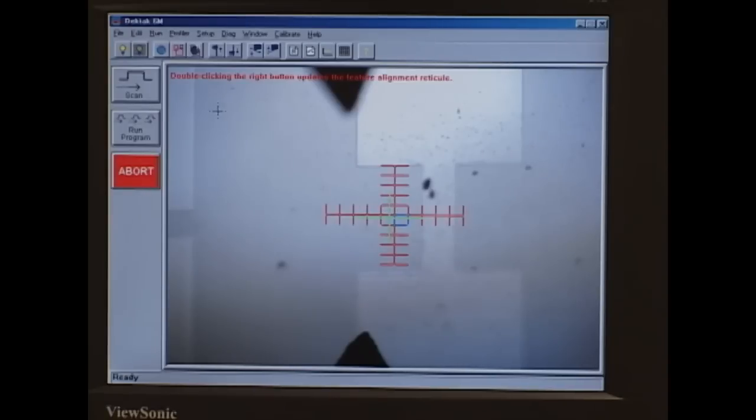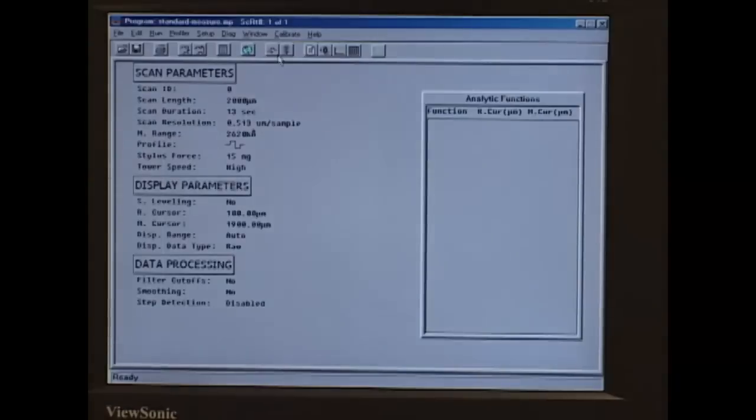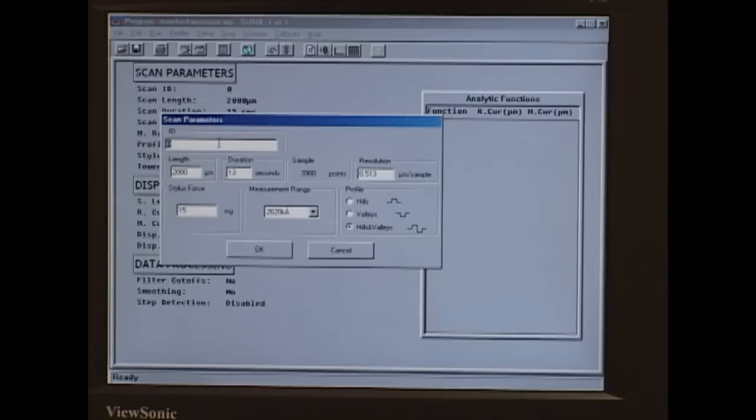So the next step would be go to the Window tab, click on Scan Routines. And this is where we can change the parameters for our scan. We'll enter an ID, the length of the scan, the duration of the scan. Changing those two parameters will also automatically change the resolution. And the force of the stylus we can change based on what kind of sample we have. If we have a soft sample, we'll want to use a low force. And if we have something like a hard sample, we know we aren't going to damage it, so we can use a higher force and then we will get better resolution.